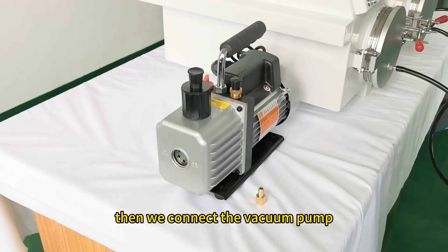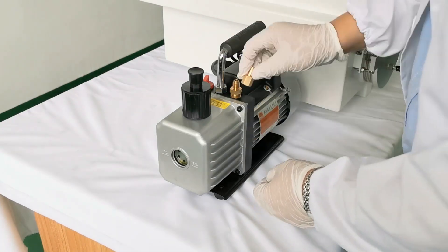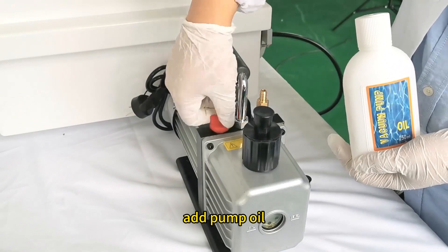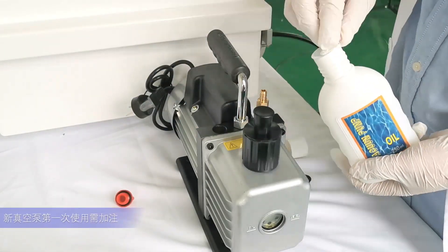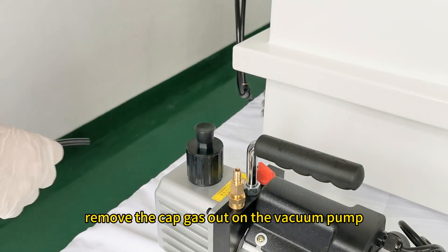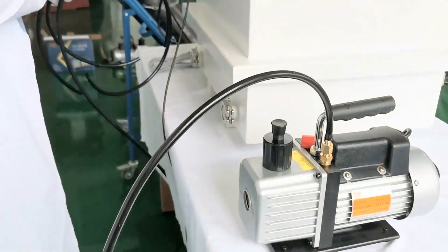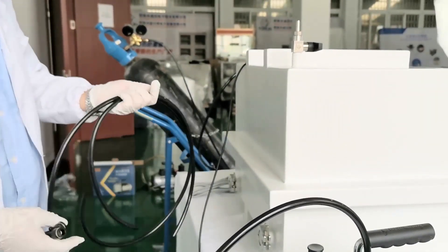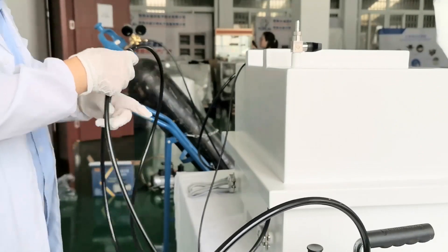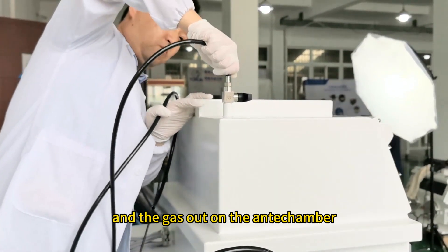Then we connect the vacuum pump. This vacuum pump needs to have the converter head installed. Add pump oil. Remove the cap on the gas outlet under the vacuum pump. From the vacuum pump, connect to the gas outlet of the glovebox and the gas outlet on the anti-chamber.